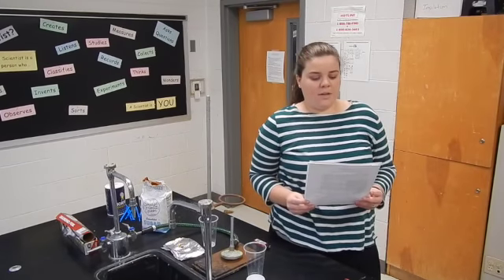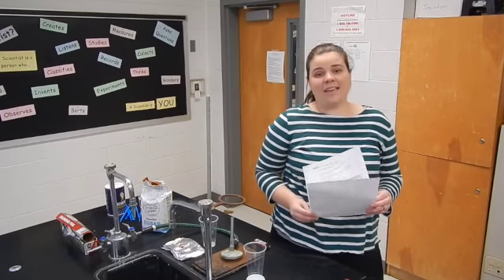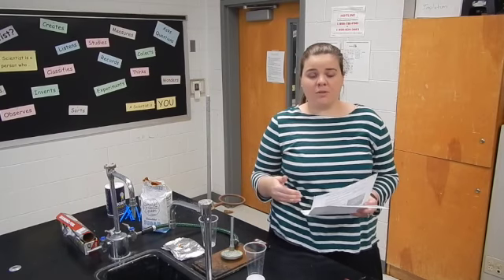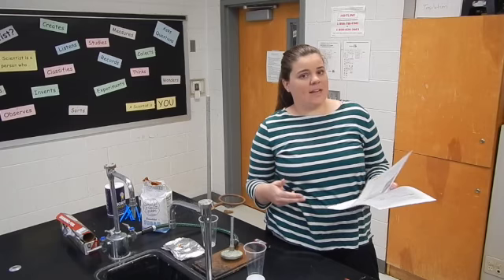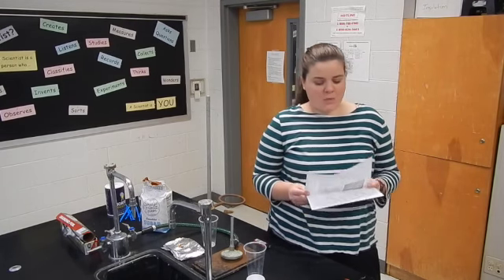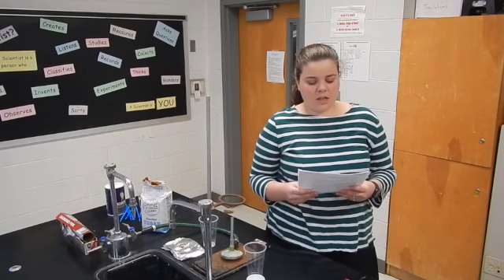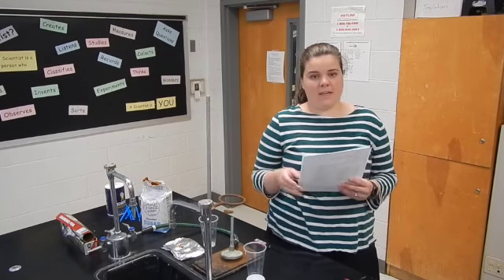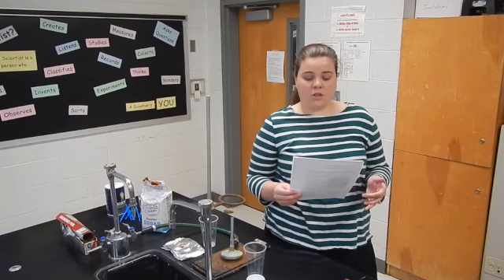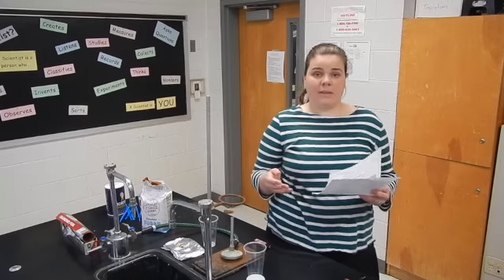Alright, so today we are doing a lab on ionic and covalent compounds. I'm going to read you through the lab and then walk you through it so you can do this lab assessment for this unit. So basically the introduction is ionic compounds are formed with metals and nonmetals, and covalent compounds are when they are all nonmetals, which we talked about in this unit.